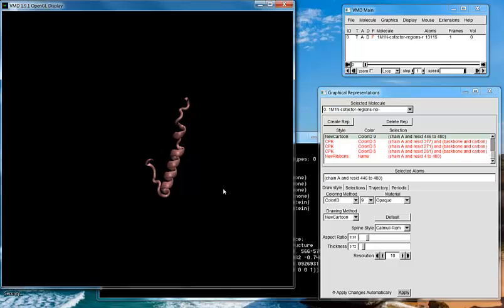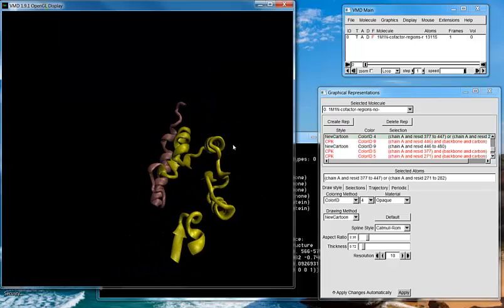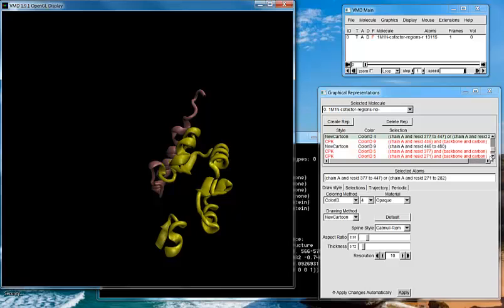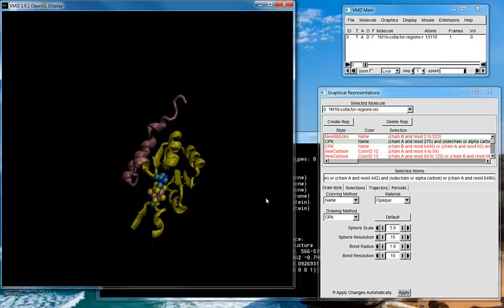This would be very simple, but I'm actually going to go to one of the other regions that is going to be a little bit more difficult, just to explain what I'm doing today. And that's the next piece here. The reason I'm printing this piece today is because, as I said, it's a little bit more difficult. I can click on that. That's the heteroatom that I want to show here.